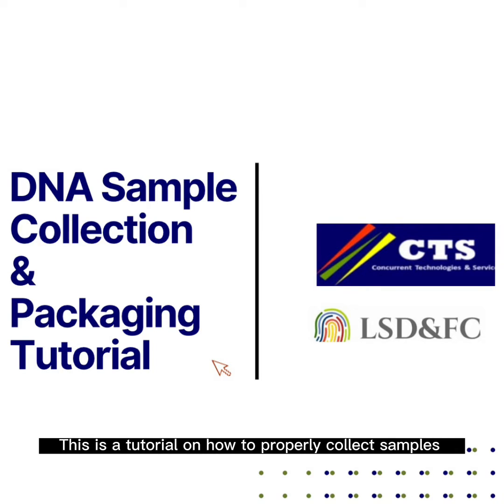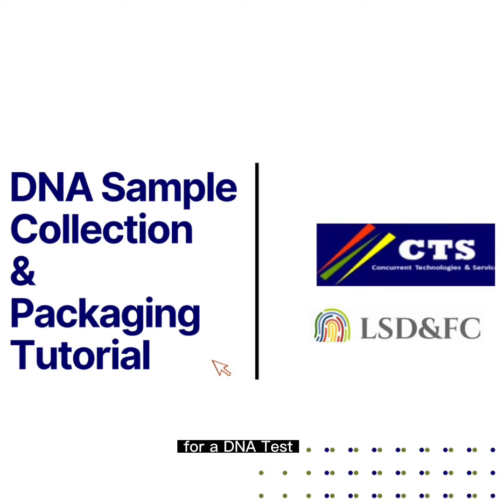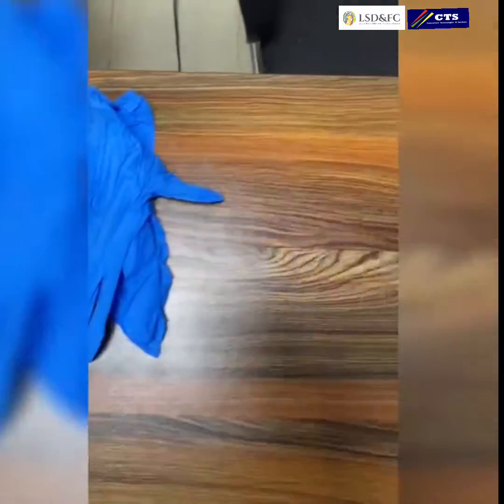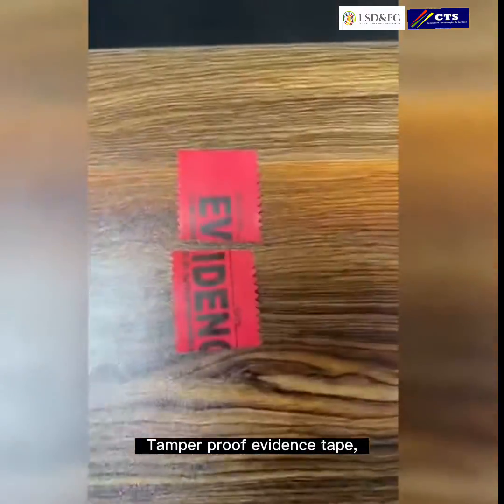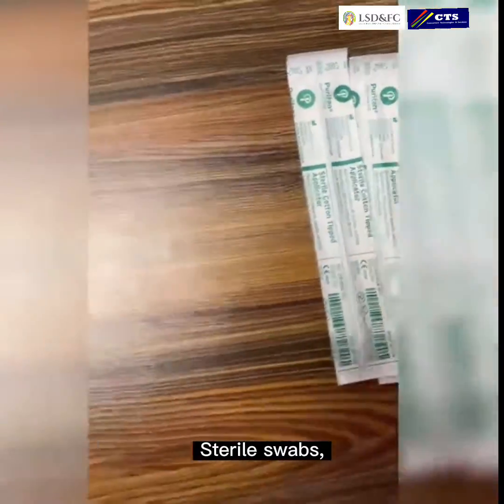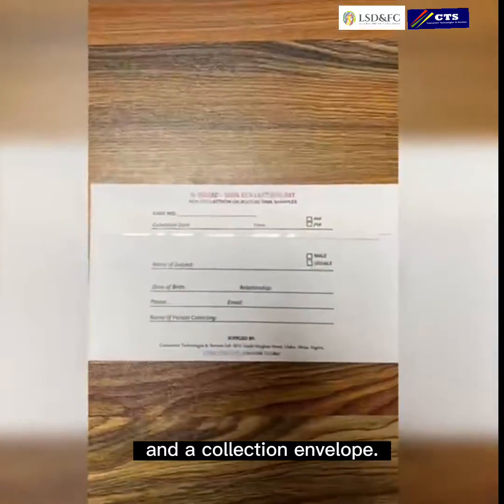This is a tutorial on how to properly collect samples for a DNA test. Each test kit comes with a pair of gloves, tamper proof evidence tape, sterile swabs, and a collection envelope.